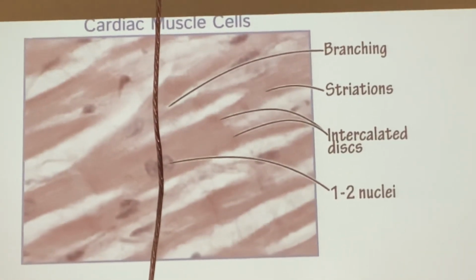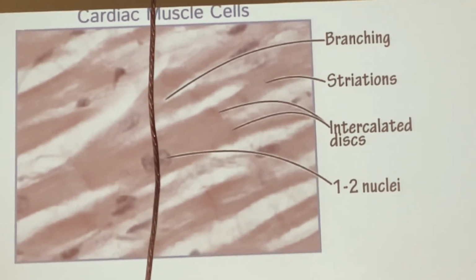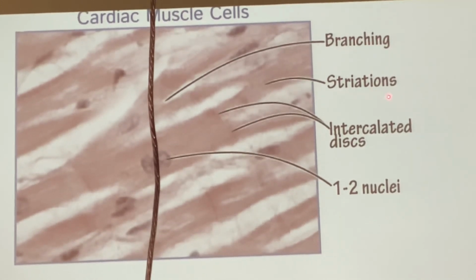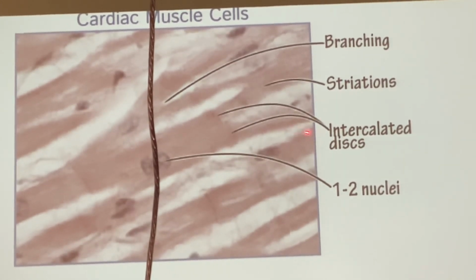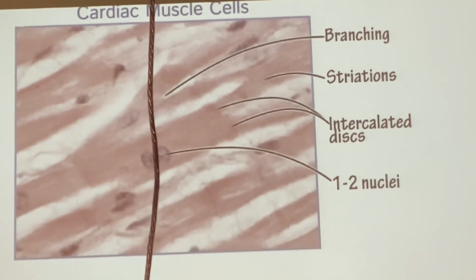Again, branching, striation, intercalated disc, one or two nuclei.